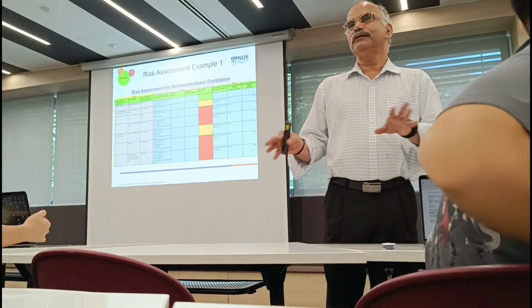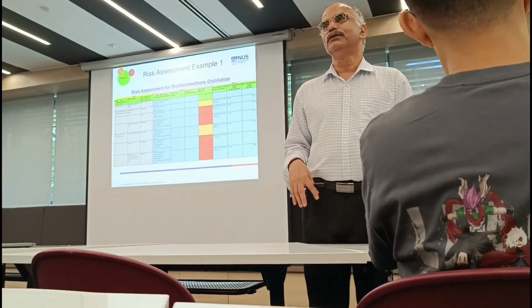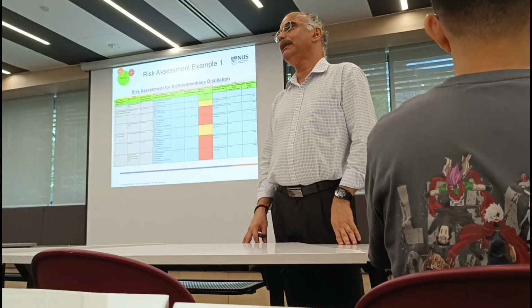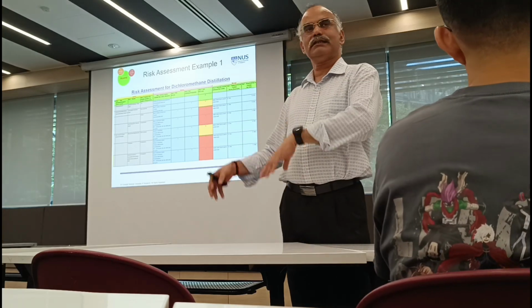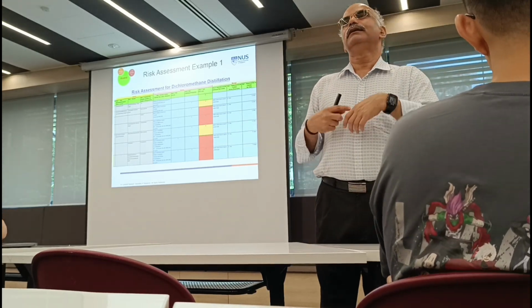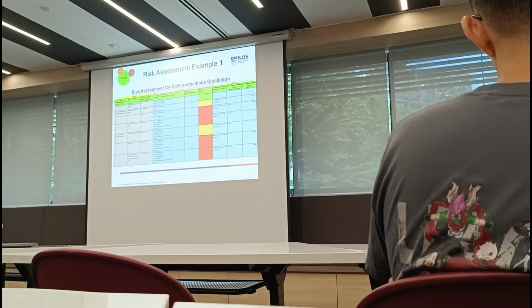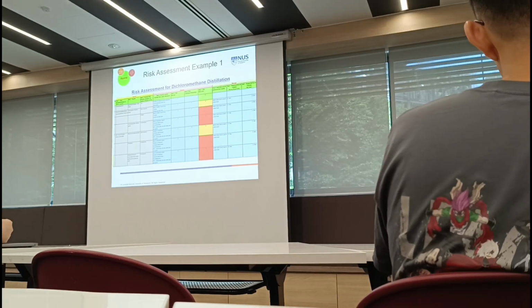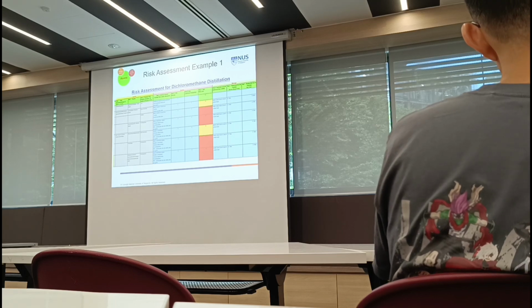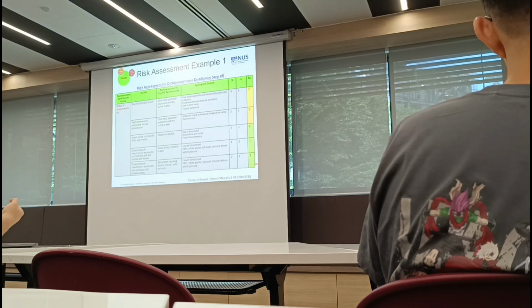But he will not do the risk assessment for every reaction you're going to do, right? He has better things to do. But he will show you how to do it. He will actually explain to you, just like what we are doing right now, right? And then you need to learn and do it. It's not very complicated. It just takes some time for you to think about your experiment. And that's the purpose of risk assessment. You need to assess and analyze the details.